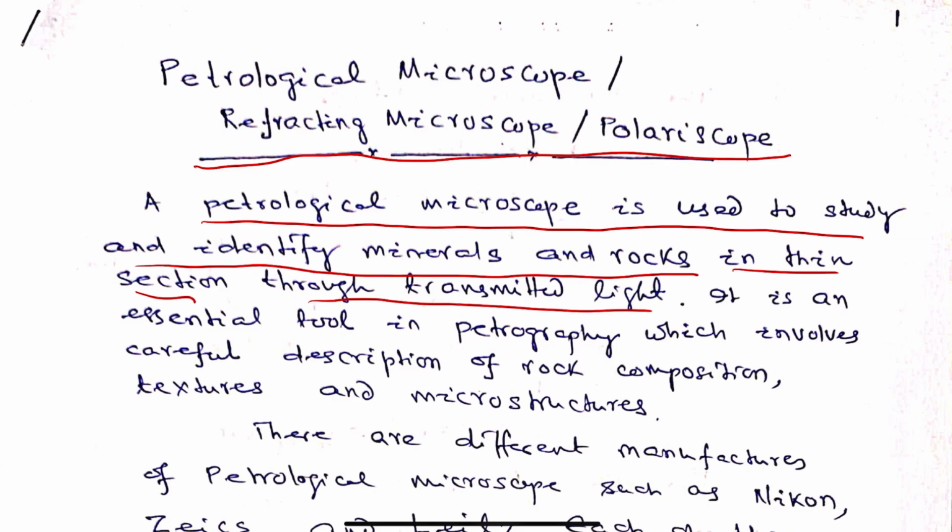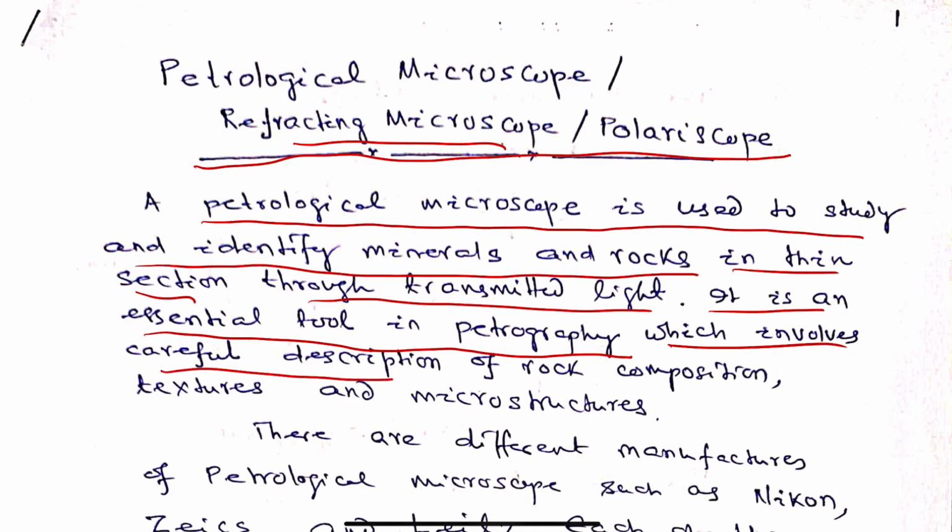So, here we will discuss the refractive microscope. It is an essential tool in petrography, which involves careful description of rock composition, textures and microstructures.